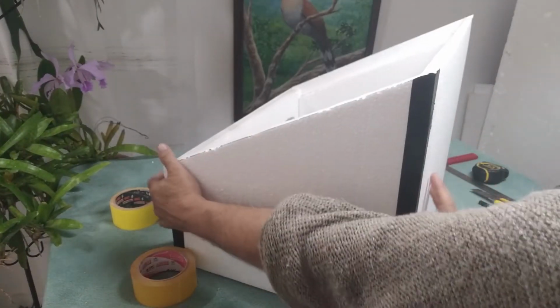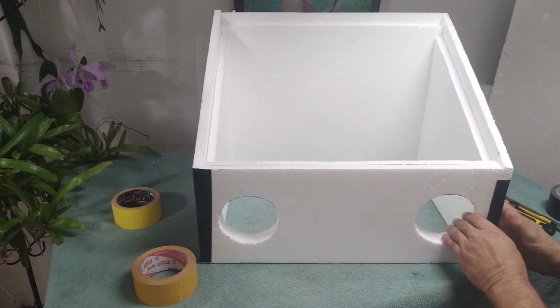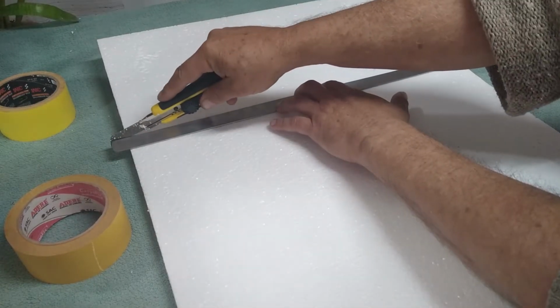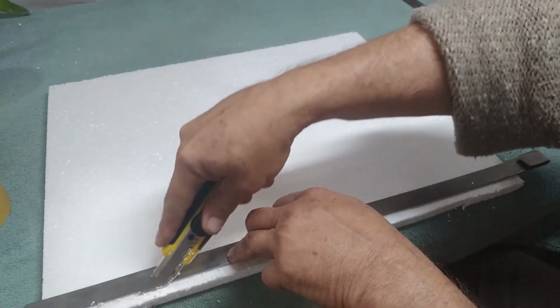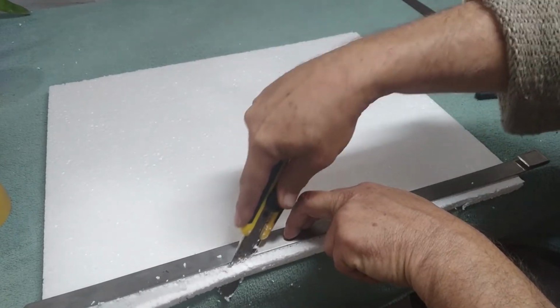There, check this out. This is a nice start. Now, let's make the top side of our box. We need a piece with 50 by 40 centimeters approximately, but you better measure your box precisely. This is an important fit. Consider that you will want to chamfer both the top and bottom edges.